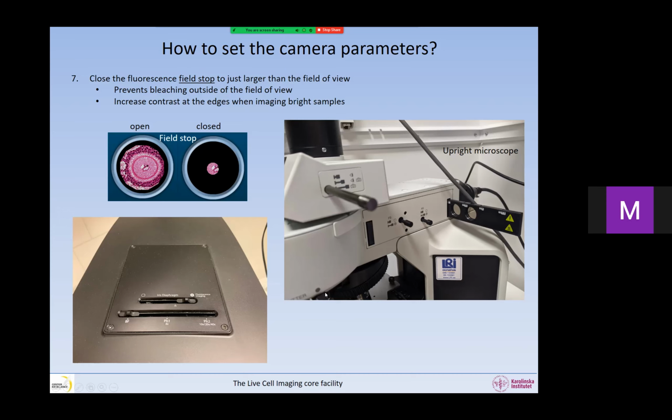Just now when you were saying that we should crop the field, when the sample is not entirely in the image, I was wondering what you would do if you had two objectives, like the 60x and the 100x with the same NA. Would you go for the higher magnification, or would you take the 63x and crop the field? So it all depends if your camera fulfills the Nyquist criterion with the 60x or not. I would always go with a lower magnification if I can.